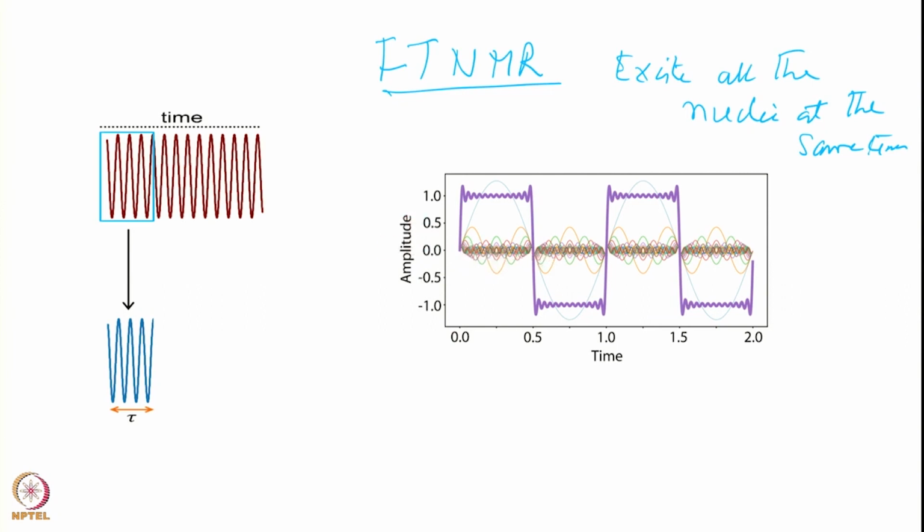In other words, the superposition of all of these frequencies is present in a time domain profile like this, which generates a superposition of frequencies.